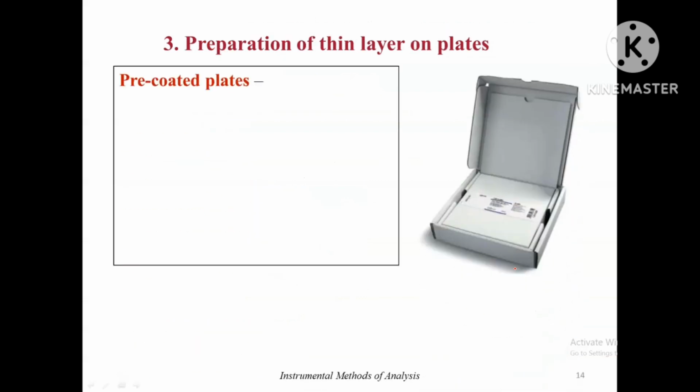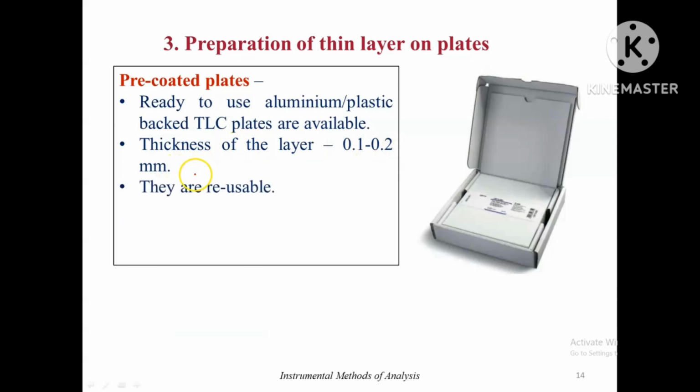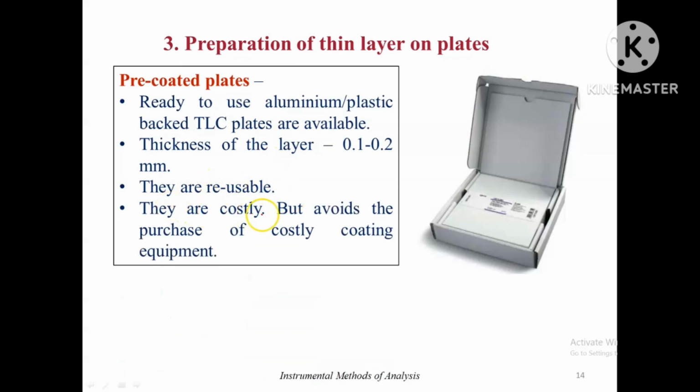Alternatively, pre-coated TLC plates are also available. They are ready-to-use aluminum or plastic backed TLC plates. They contain approximately 0.1 to 0.2 millimeters thickness. These pre-coated plates are reusable, but they are costly. But because they are reusable, they avoid the purchase of costly coating equipment.